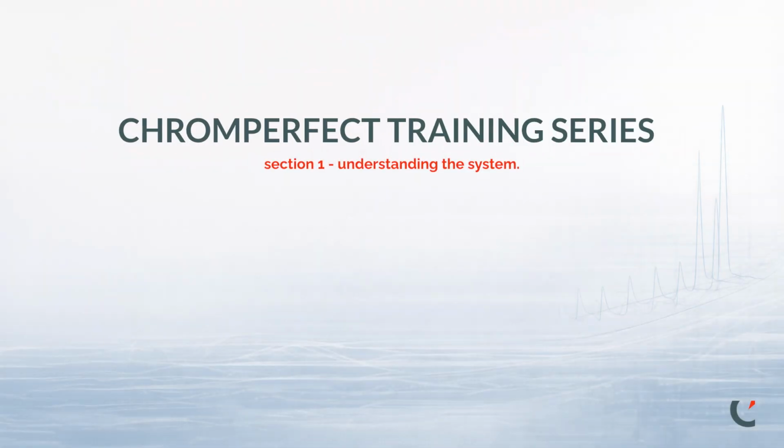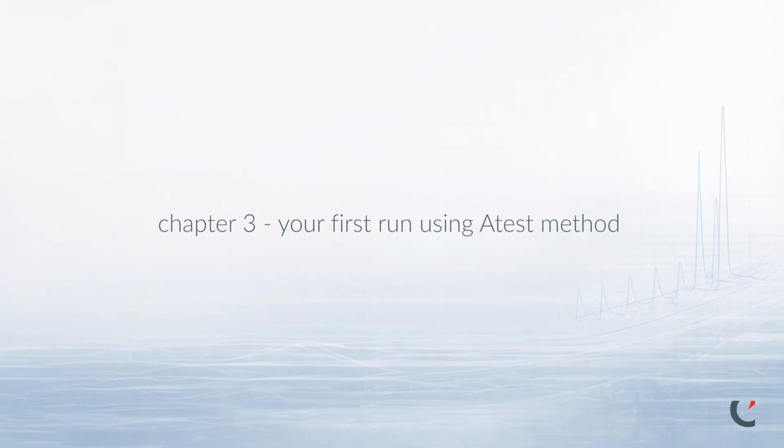You are currently working through Section 1, titled Understanding the Chromperfect System. This is Chapter 3 and the last chapter in the first section. Today, we will walk through your first data acquisition run in Chromperfect.